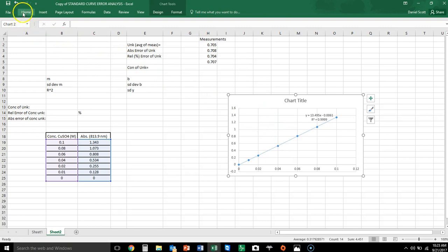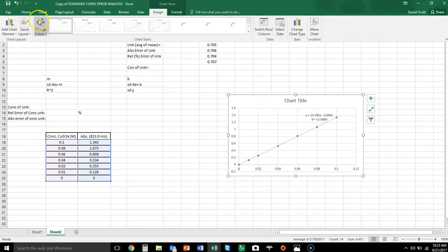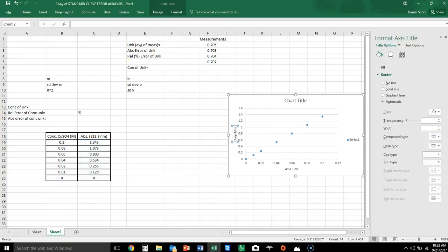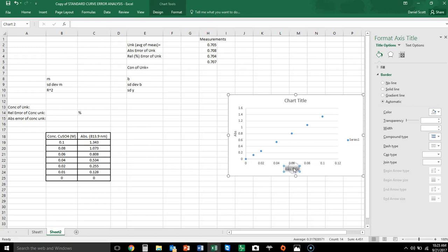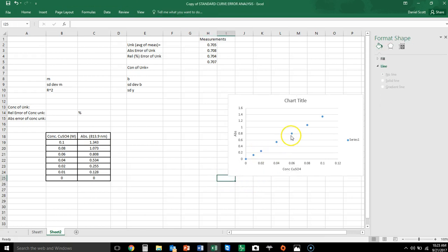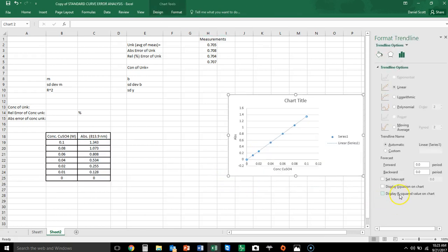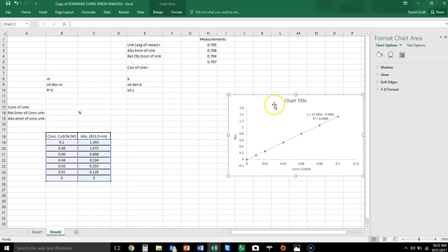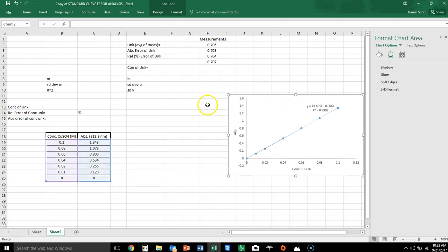We can tidy it up a little bit. This here is the absorbance of the samples and this is the concentration of the copper sulfate. Let's add our trend line back on there. So there we have it — here is our standard curve.